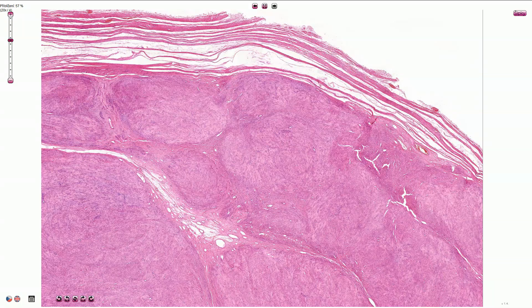Leiomyoma of the uterus is a very common benign tumor composed of smooth muscle cells. According to the localization, we can differentiate submucosal leiomyomas, intramural, or subserosal leiomyomas.